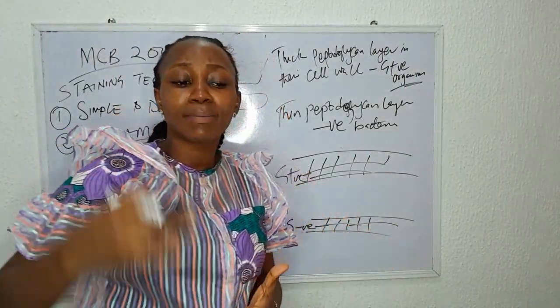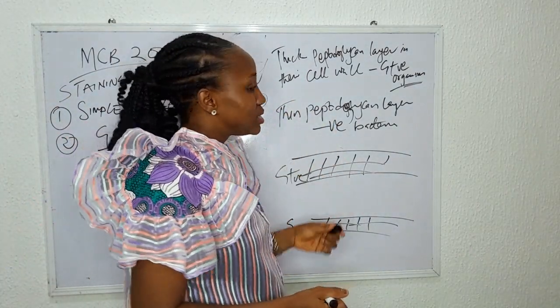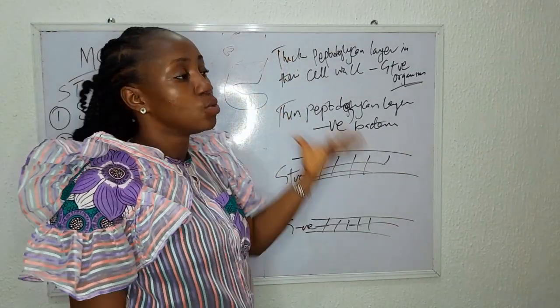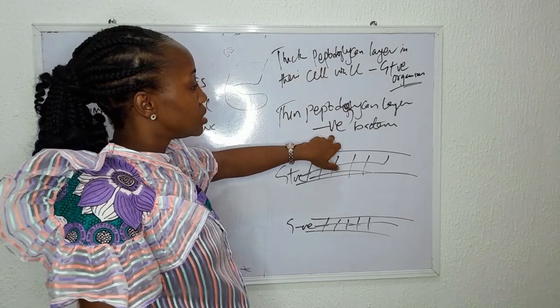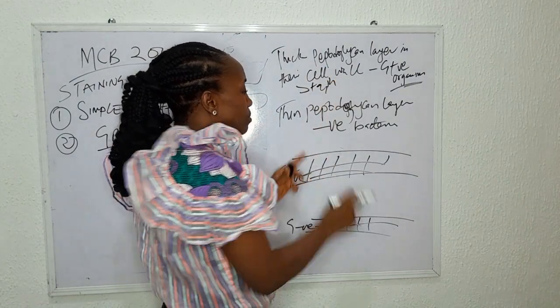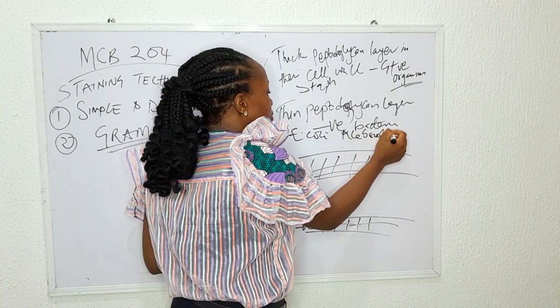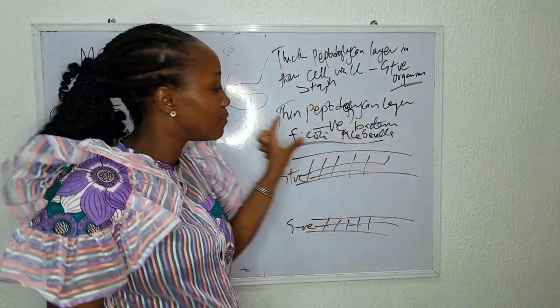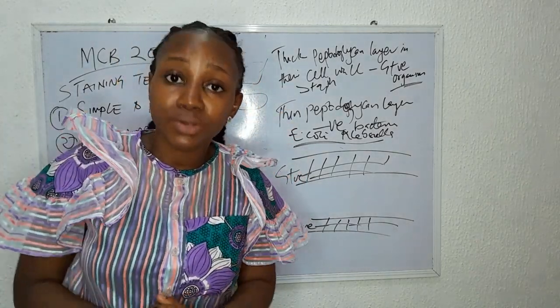We're going to be talking about the 4 stages that we do in gram stain so that you understand what I'm talking about. But this is basically the principle of everything we'll be talking about today. This is why we use the gram stain, and why we differentiate these organisms into gram-positive and gram-negative. An example of a gram-positive organism is Staph aureus, while for gram-negative organisms, you have E. coli and Klebsiella. Uniquely, these organisms are very significant in causing diseases, not really because of the peptidoglycan for gram-negative organisms, but because of the lipopolysaccharides found in their outer membrane. We'll get to that as we go on.